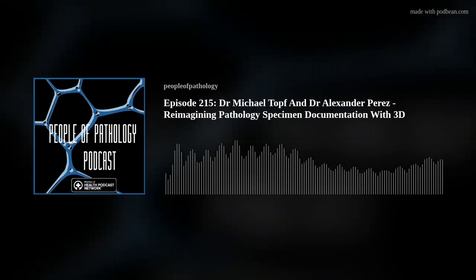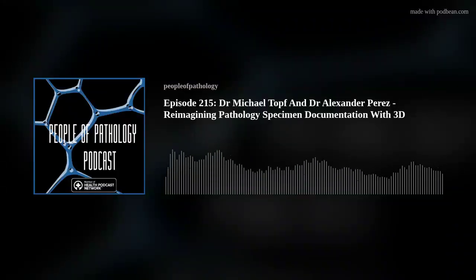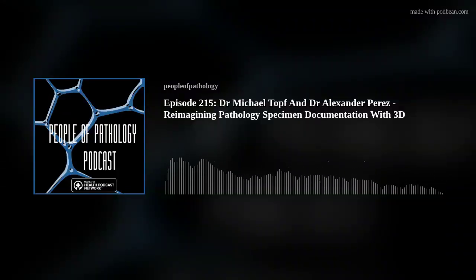So a 3D model makes it so you can look at any surface you want, from any angle you want, and you can really try to visualize in your head what's going on, as opposed to just trying to click through 5 or 6 images and piece together how they correspond to each other, to make signing out the case the most accurate process possible. So I think the 3D scanning offers just a new dimension to what you can view about a specimen.